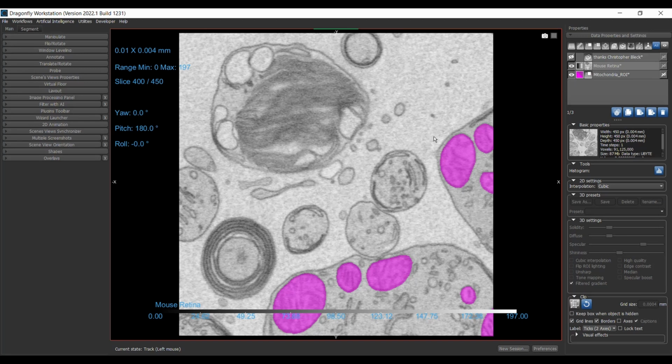One most important thing here is that my training output should be in the form of a dense multi-ROI, which means every pixel must be labeled as one of the classes. In my case, each pixel must be either a mitochondria or a background pixel, as it is a 2-class problem.